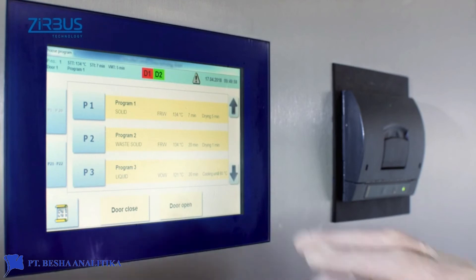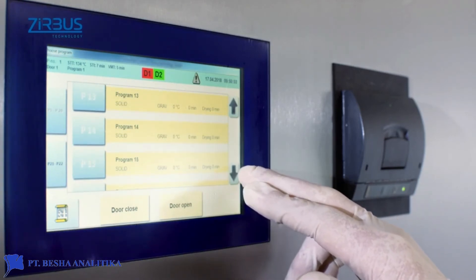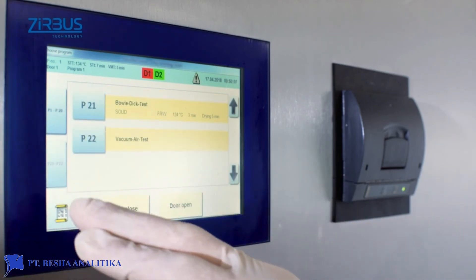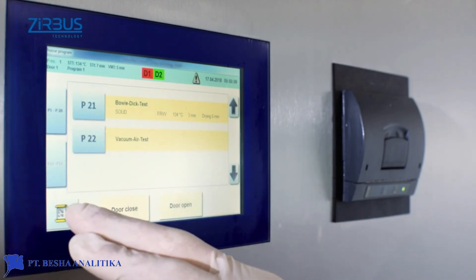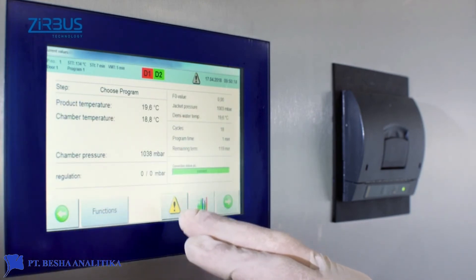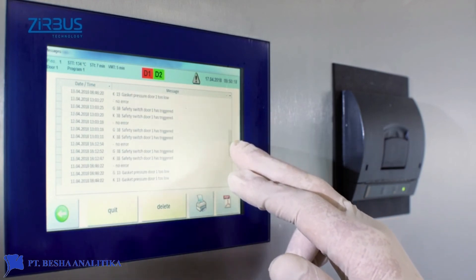A standard 7-inch touchscreen display with 20 fully customizable program channels serves as the user-friendly interface. The sterilizer can also be controlled from an industrial PC for additional functions such as process visualization, independent documentation, and up to 99 program channels.